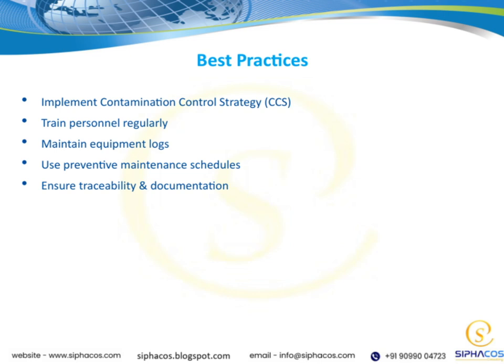Next, training personnel regularly is crucial. Well-trained staff are our first line of defense. They need to understand contamination risks and proper procedures to minimize those risks in their daily work. Ongoing education keeps everyone up to date with the latest standards and practices.